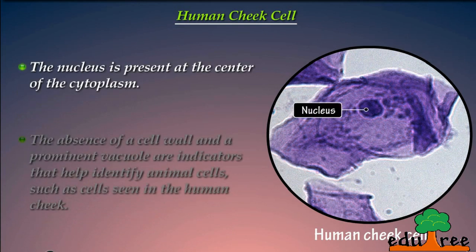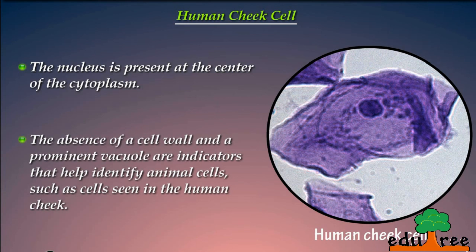The nucleus is present at the center of the cytoplasm. The absence of a cell wall and a prominent vacuole are indicators that help identify animal cells, such as cells seen in the human cheek.